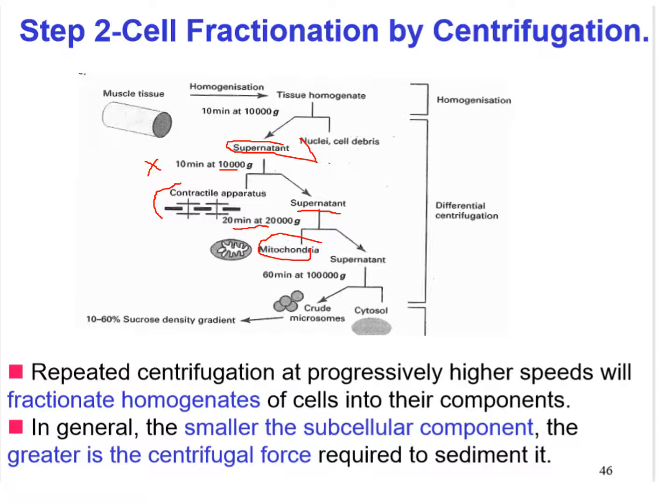The mitochondria will appear in the pellet. So these are the pellets here. Here was the original pellet. The pellet here is the nuclear pellet. Then the supernatant gives us supernate and pellet, supernate and pellet. And now we have an hour at 100,000. We get cytosol, probably not a lot of organelles, and vesicles that transport remnants of the Golgi and others. And we can apply those to a density gradient using sucrose, and we'll get into that.